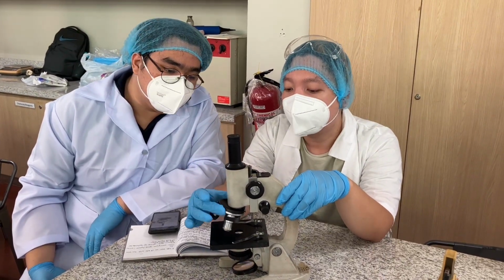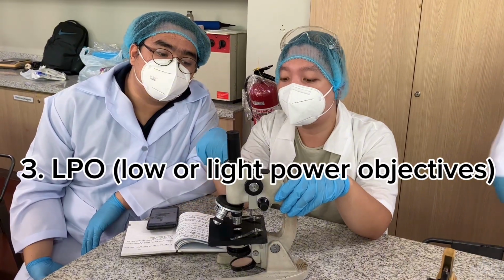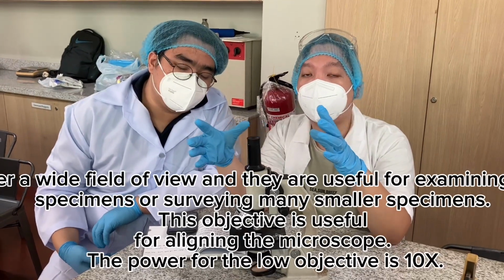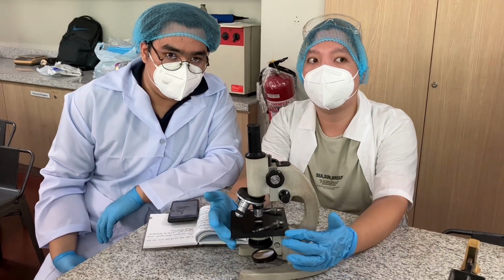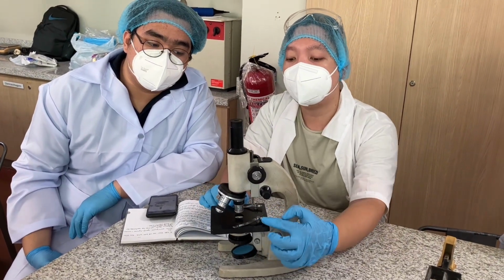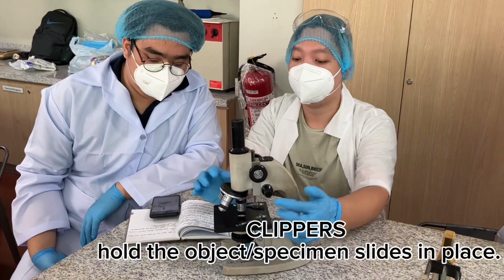And lastly, we have here the LPO, or the low-powered objective lens. And this one will make sure that it will be much more condensed as well. Now moving on, we have here our stage, and the stage with clippers is where we put our specimen, and of course the clippers will be the ones that hold the glass slides and cover slips.